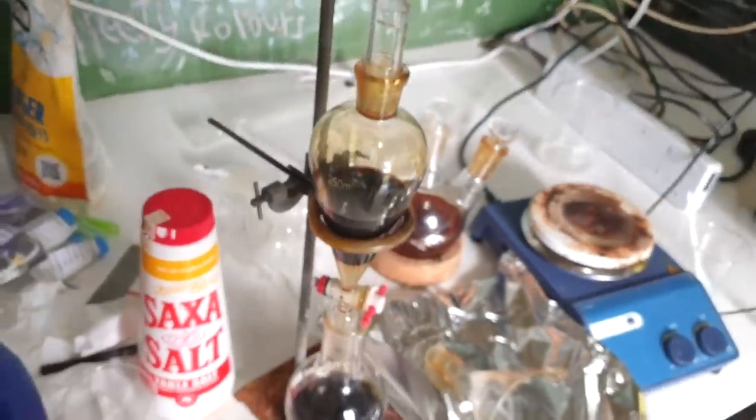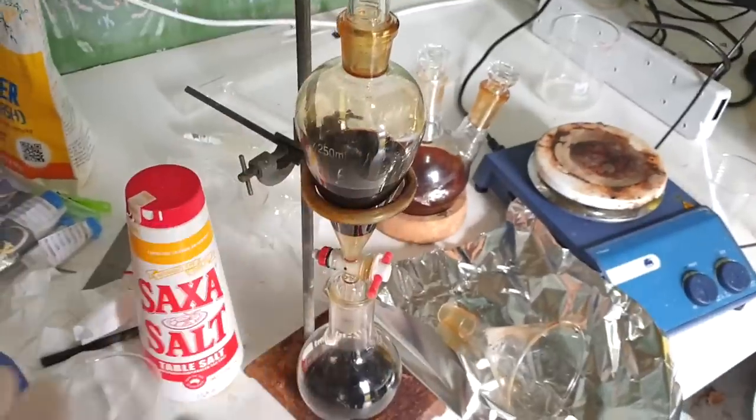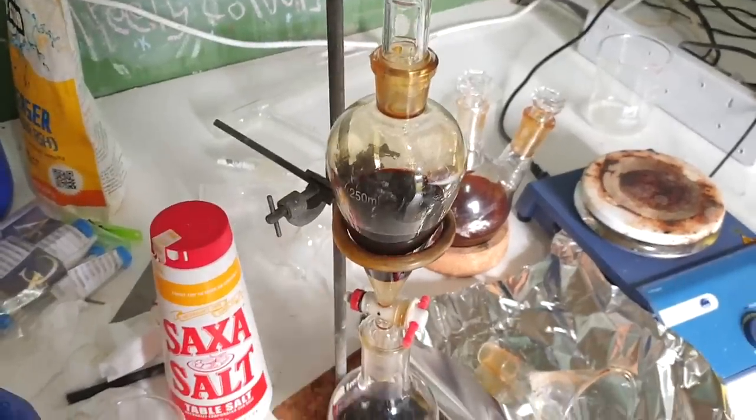Just one final brine wash. I'm going to shake this very gently. In fact, I'm not going to shake, I'm just going to swirl it together. I hope for the best to get all the water and all the sodium hydroxide out. Just left with a horrible tarry toluene layer.